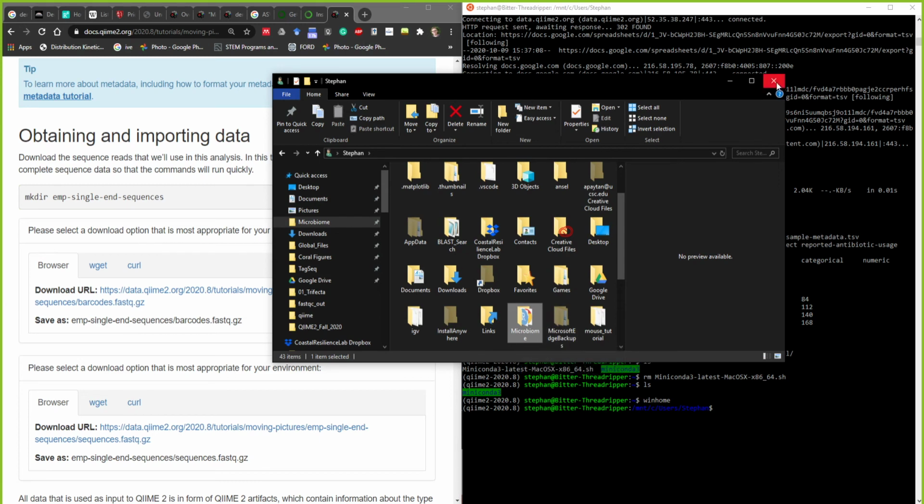Everybody working on a Mac, I'm not sure if it's as important. So what you'd want to do is type in cd, change directory, mount C users, and after users, you'll want to actually put your user name. Okay. So instead of make directory, do you see the chat? Yeah, mount C users. Okay, cd. Yeah, so just cd copy mount C users. Okay. You can copy that, and then.